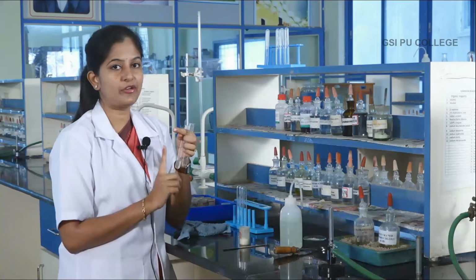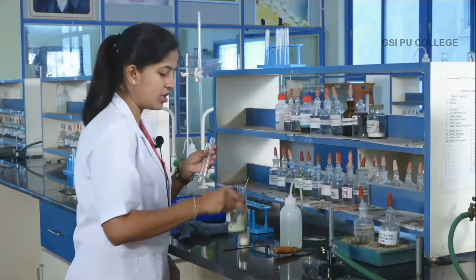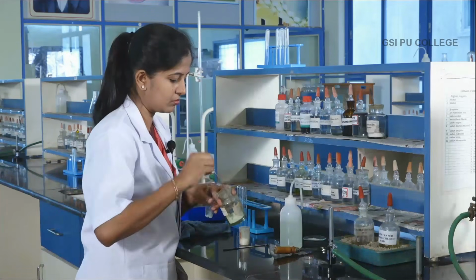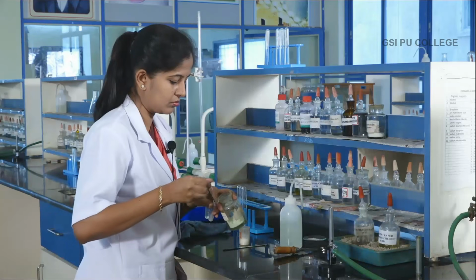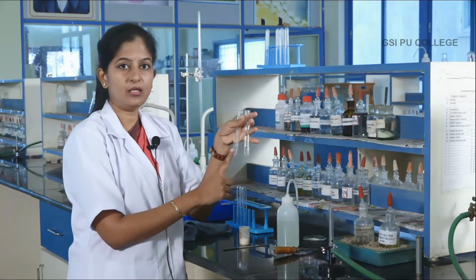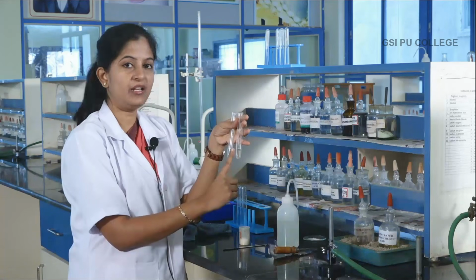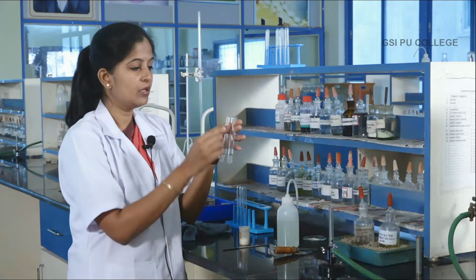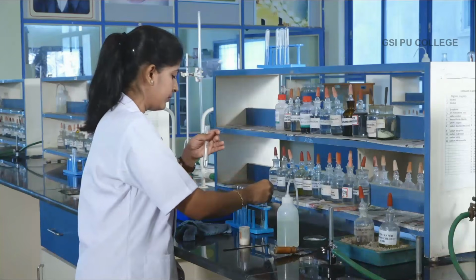In the other test tube, you have to prepare an aqueous solution of ferrous sulfate. So, take a small amount of ferrous sulfate. So, in one test tube, I have prepared the given salt solution. In the other test tube, I have prepared ferrous sulfate solution. Keep your ferrous sulfate solution aside for a few minutes.